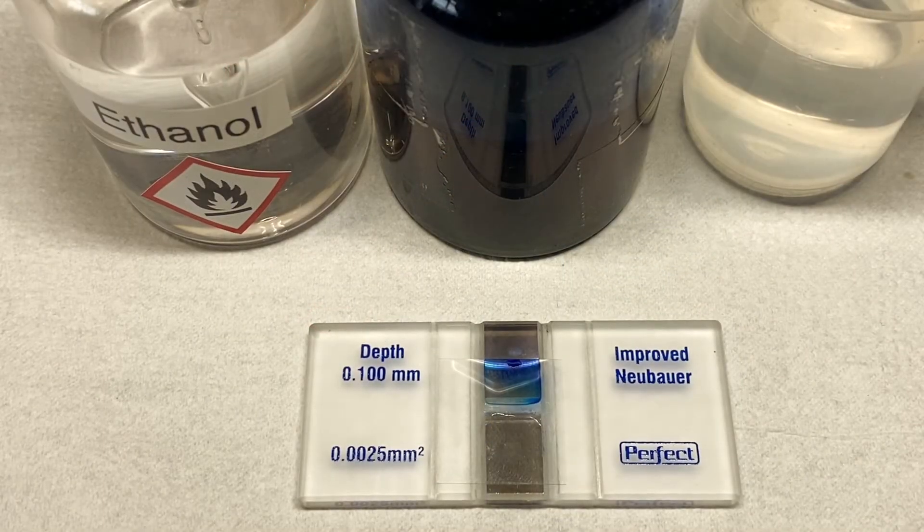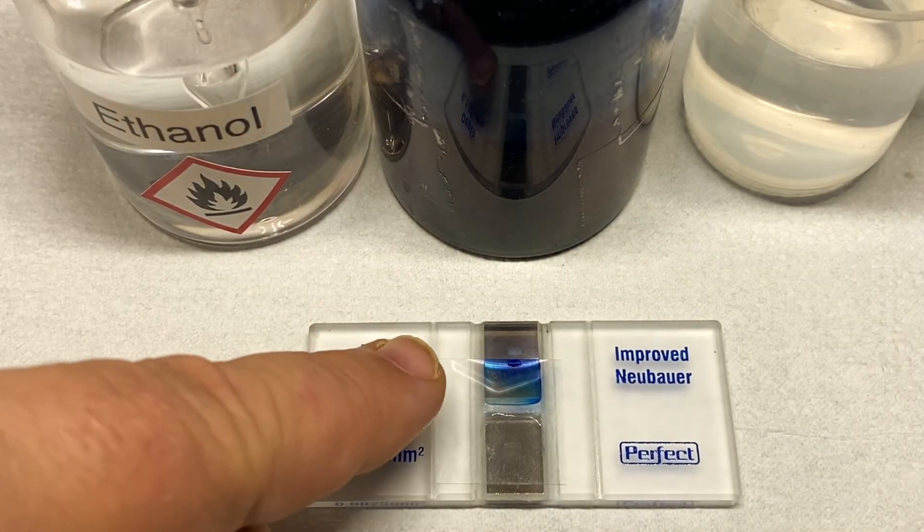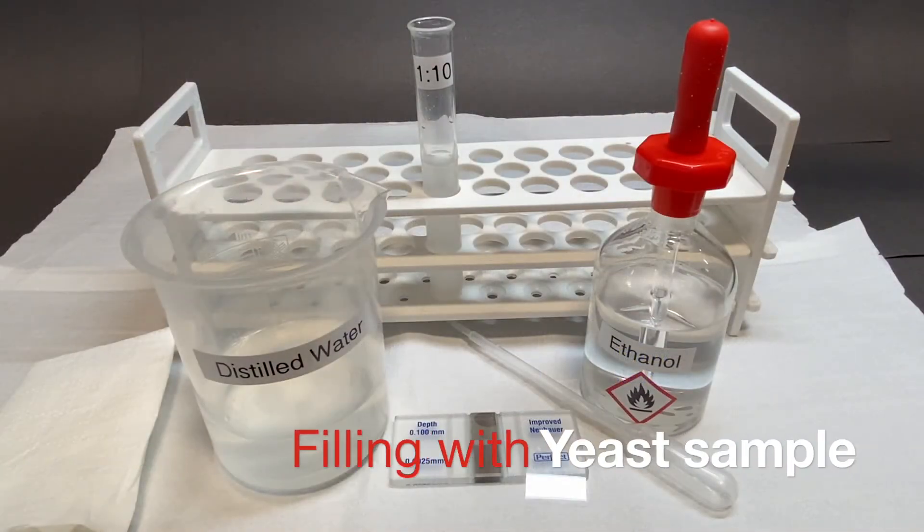After settling, the sample should appear something like this. Filling the hemocytometer with a yeast sample.